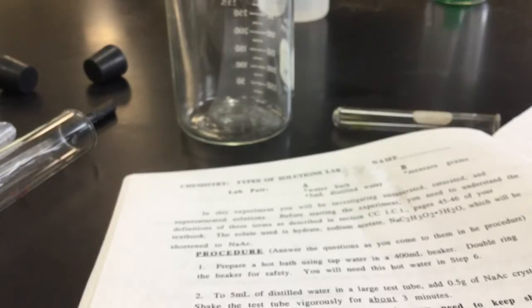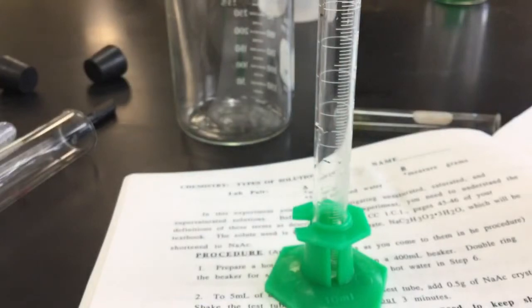Hey, this is Mr. Scott. I'm going to run through the sodium acetate lab and show you in case you're absent. So we're going to work with some water as our solvent and we're going to work with some sodium acetate.